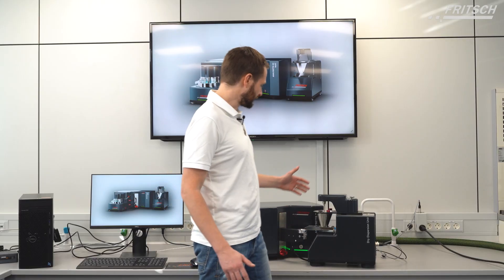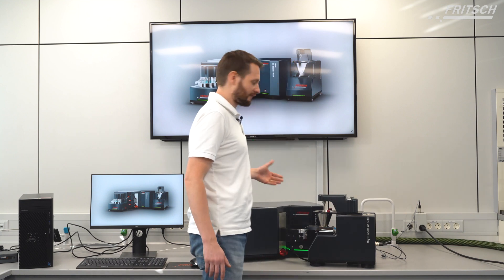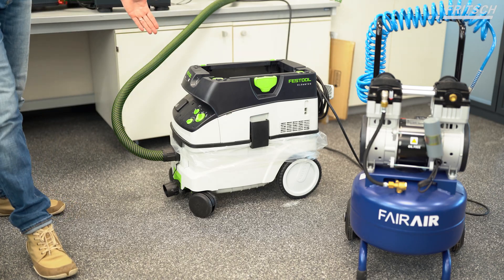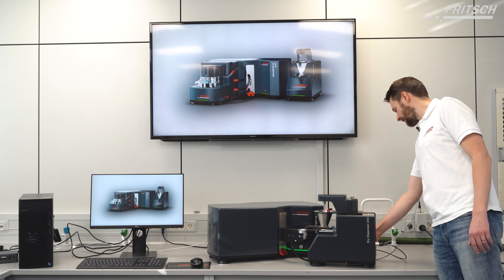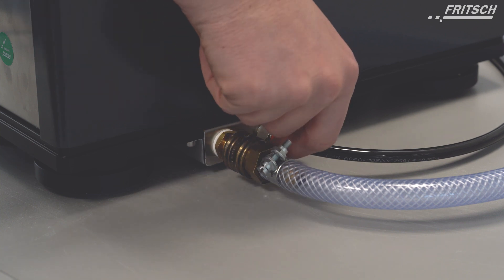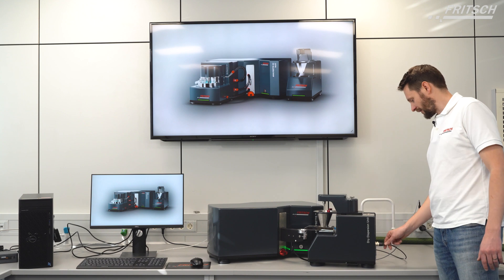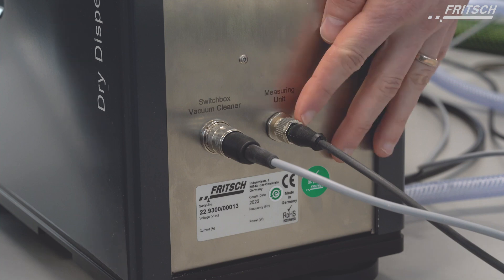In our lab, we have connected the dry unit to our internal air pressure and also to our vacuum system. Of course, we can also supply you with an external vacuum cleaner and an air compressor. The connections for compressed air are at the back of the unit — the socket for compressed air and the connection to the measuring cell — along with the connection for the switch box, which automatically controls the vacuum cleaner, right next to the connection to the measuring unit.